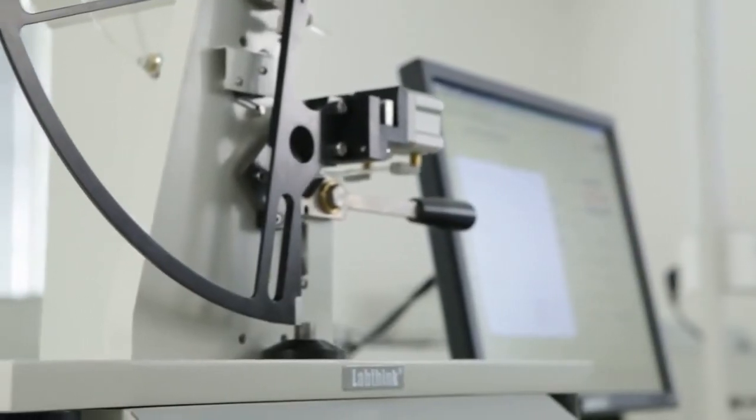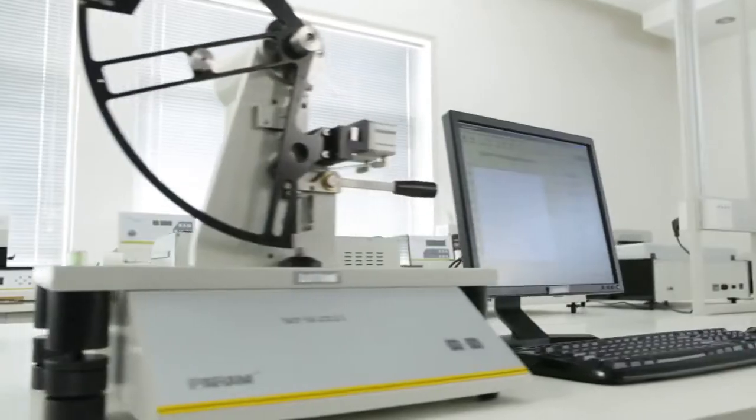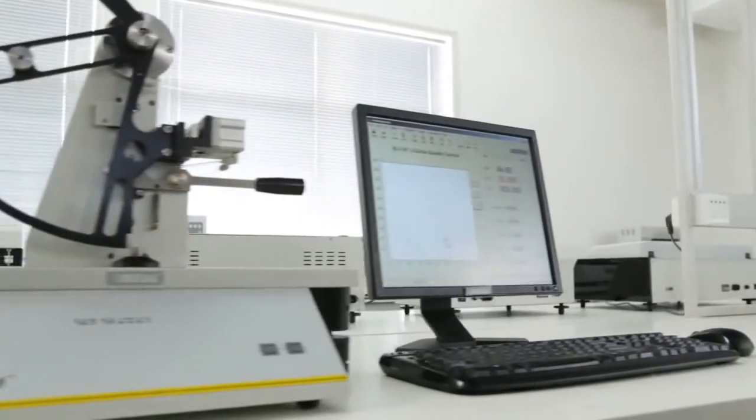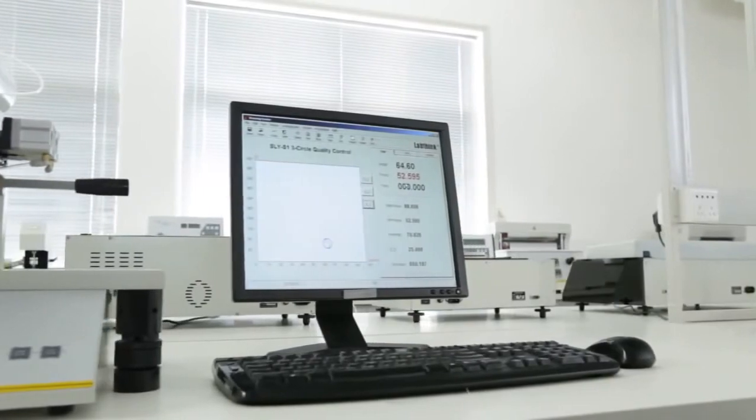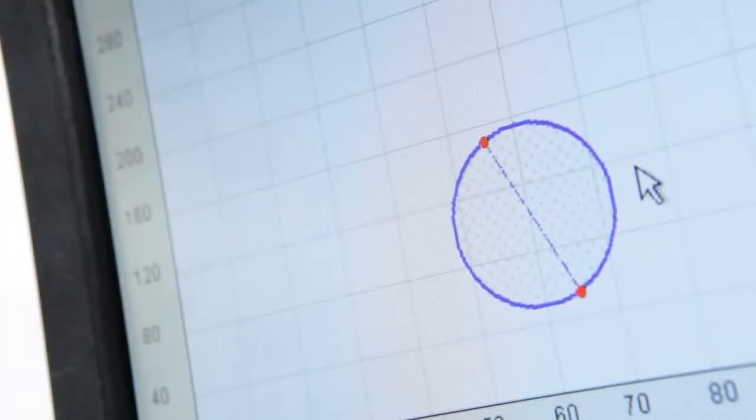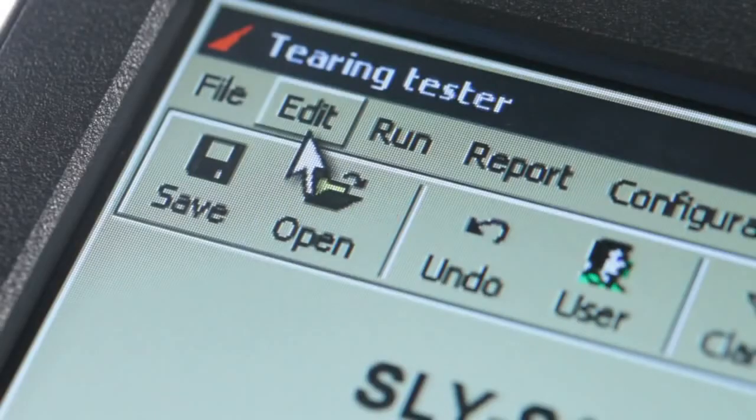The testing software designed by LabThink has an intuitive operation interface and visual display of real-time data and graphs.